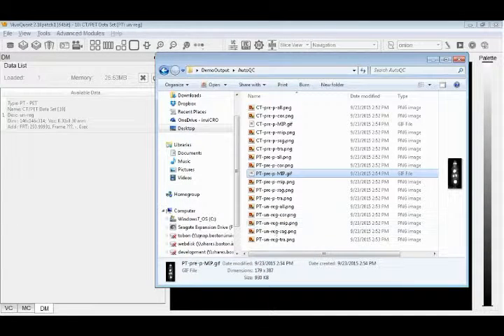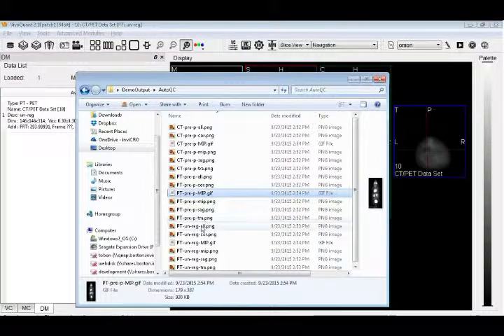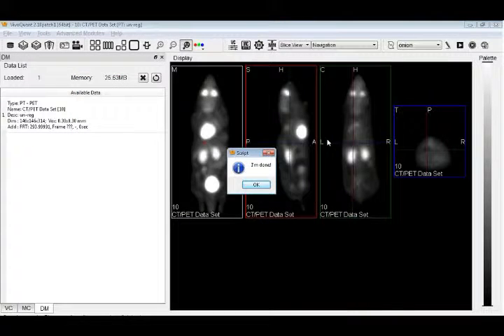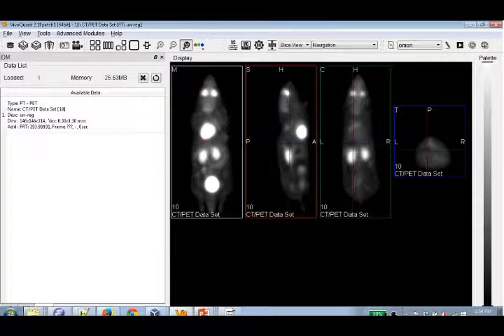Okay, that report ready. One more is being done. Okay, fantastic. I think that brings us close to the end. Let's stop there, and I'll just describe a little bit of what else you could do. You could go through the different operators. You could use them to segment automatically. You've obviously seen what the Onion tool can do.